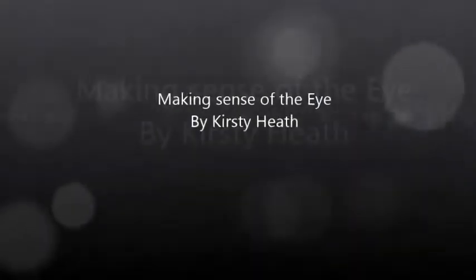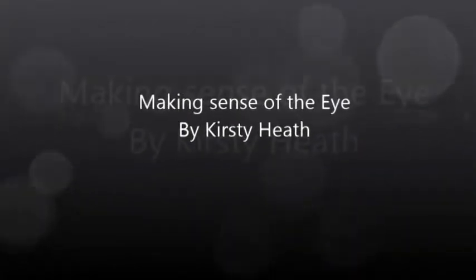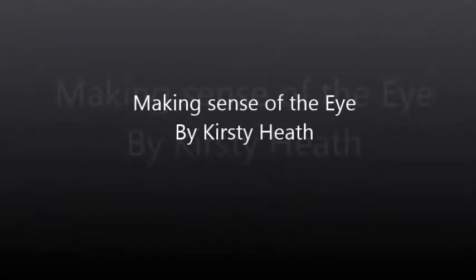Hello and welcome to my practical on making sense of the eye. Today we are going to dissect a pig's eye in order to get a closer look at the main structures.